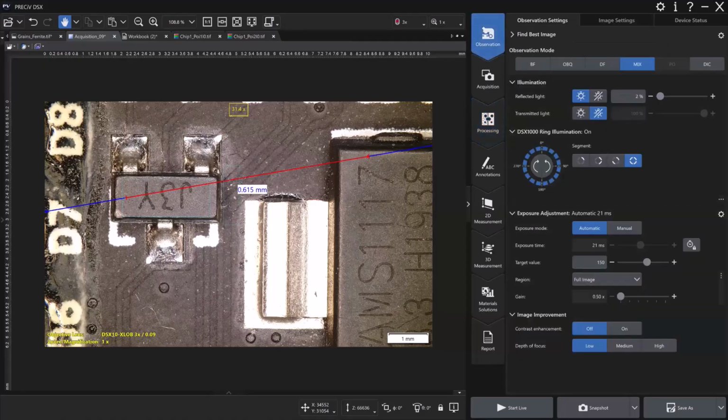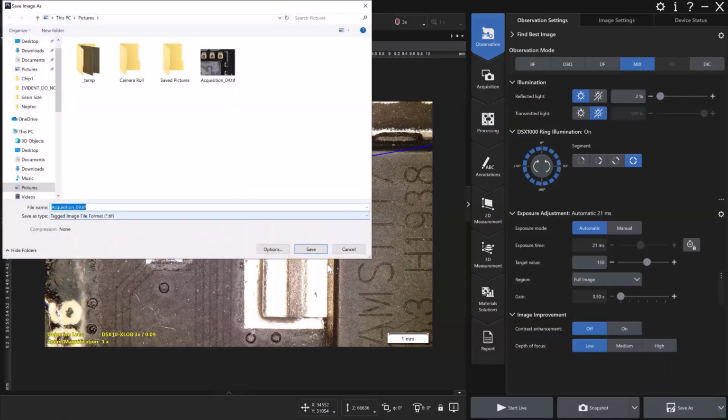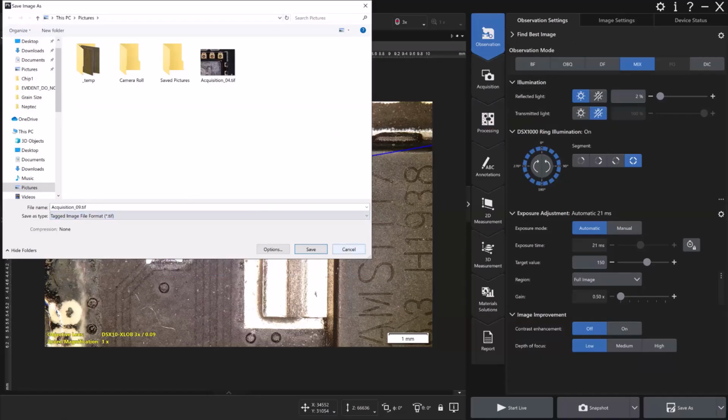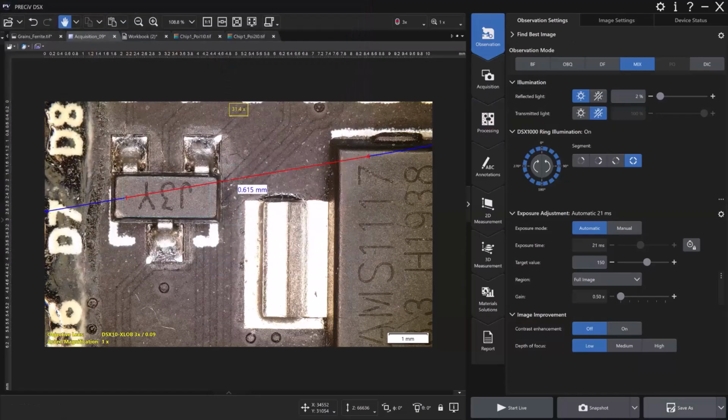Images and measurements able to be exported. I think you talked about exporting. I know. I think kind of a related question. I'm assuming that you have canned reports there, kind of standard formatting for reports. Can those be modified, the templates themselves, to your own kind of internal needs?